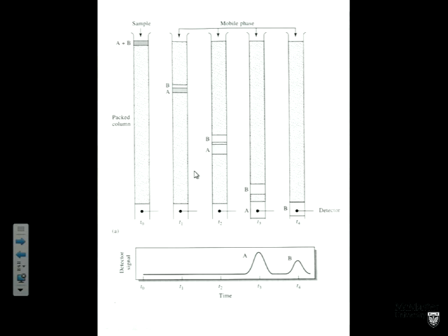And in silica gel chromatography, silica gel is very polar. Silica gel is always the most polar species in the mixture. So if I have a non-polar solvent or a less polar solvent and a more polar stationary phase, then like dissolves like, and consequently the polar molecules will bind to the silica. So the elution order is always that the more polar compound comes off last on silica gel.